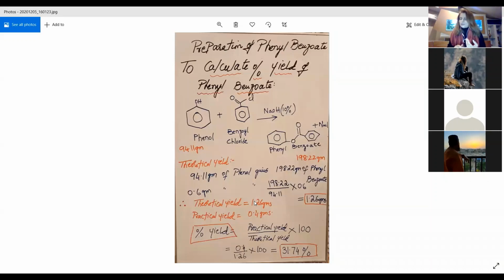You're going to divide these two values, and you are going to multiply it with the starting material you took. That is how much amount you took in the beginning of the main reagent, right? So that was 0.6 grams in this case. So in that way, they will never be the same. It would be a miracle if both the values were the same. I don't think so. There is a difference always, because both are found through different patterns.